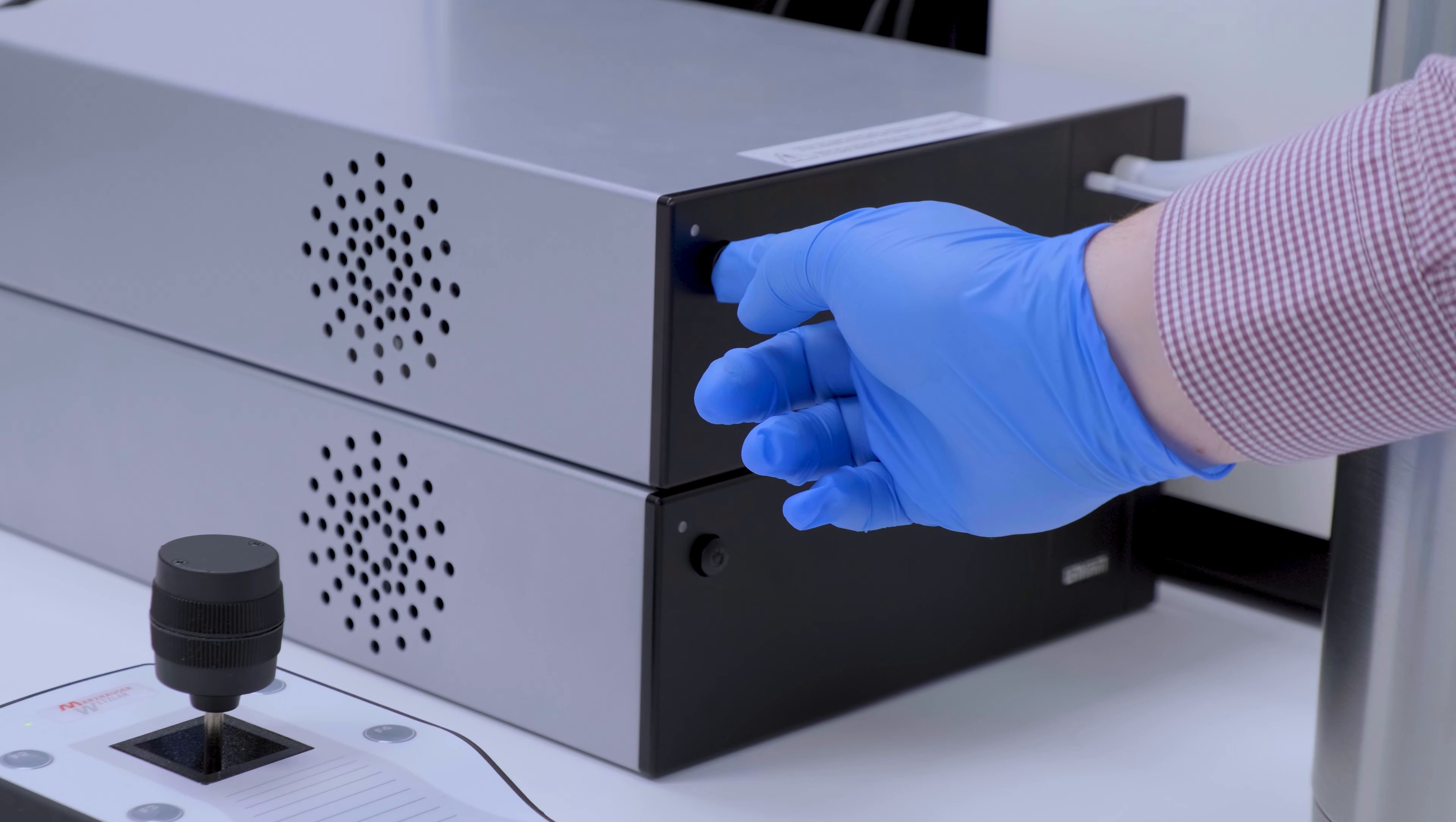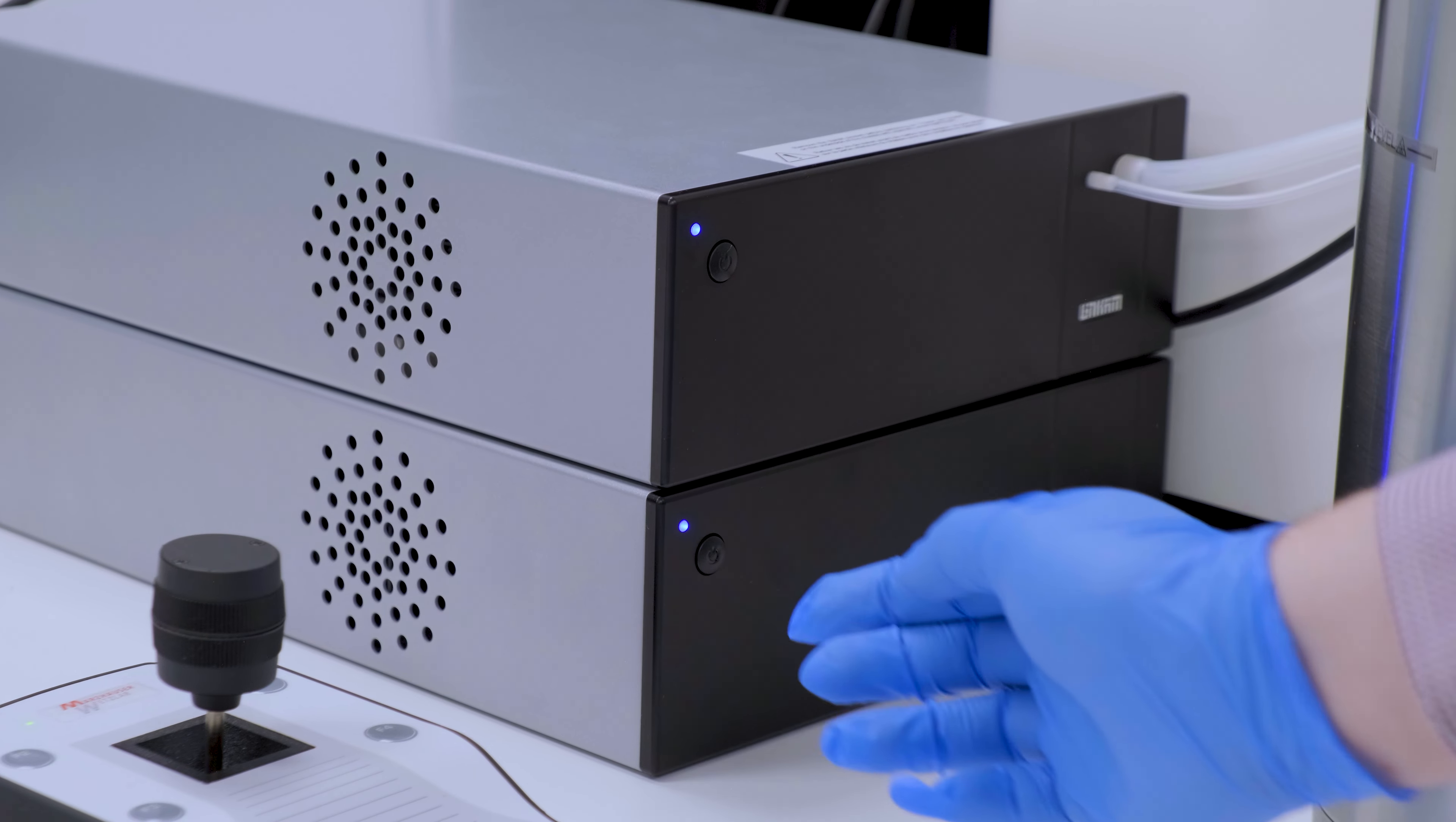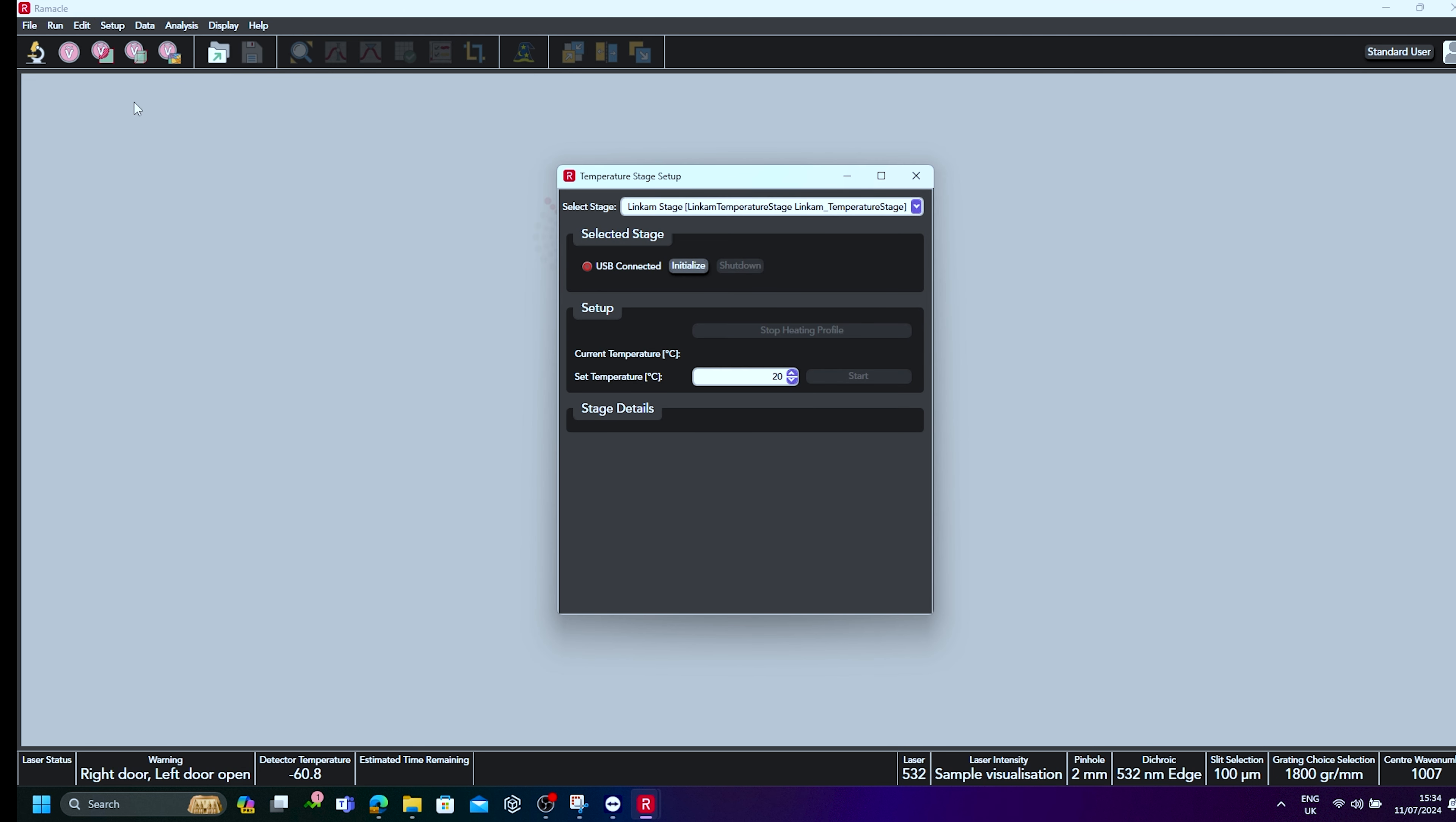Next, turn on the LNP96 followed by the T96. To initialize the temperature control system in Ramacle, select Setup followed by Temperature Stage Configuration. Then click Initialize. You will now be able to change the temperature of the stage through Ramacle.